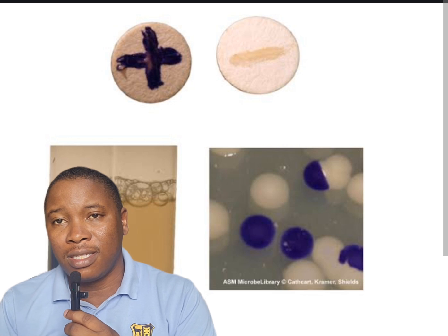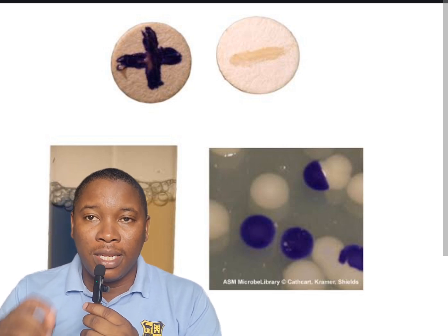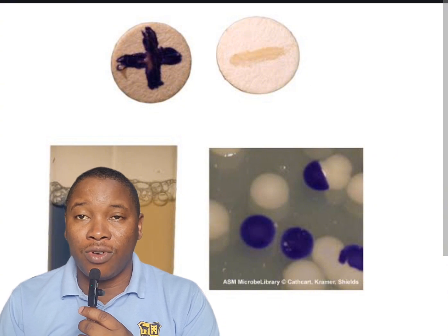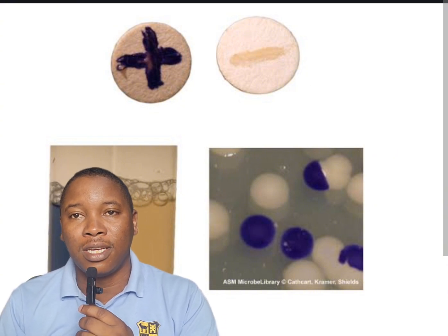It's important to make this distinction because there are many different types of oxidases. So this particular oxidase test that we usually run in microbiology is for cytochrome C oxidase. This is important to note.